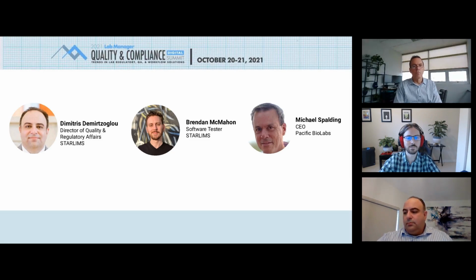Our speakers today will discuss barriers to quality and compliance within the lab, how to overcome them and achieve quality standards, how having an automated validation framework can improve lab efficiency and productivity, and use cases for automated validation.